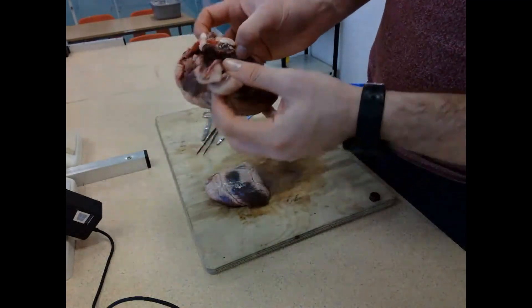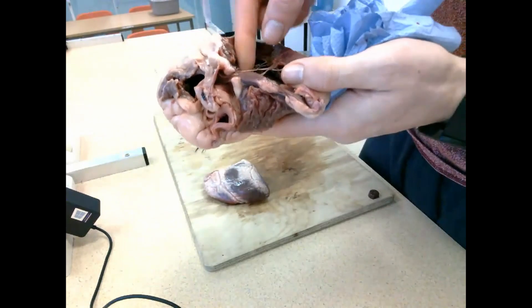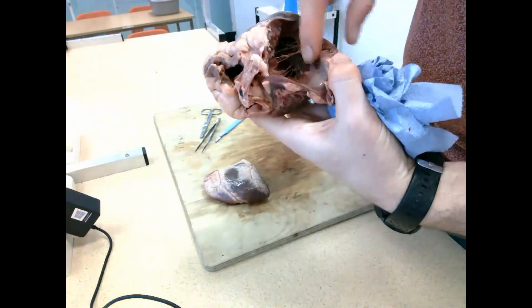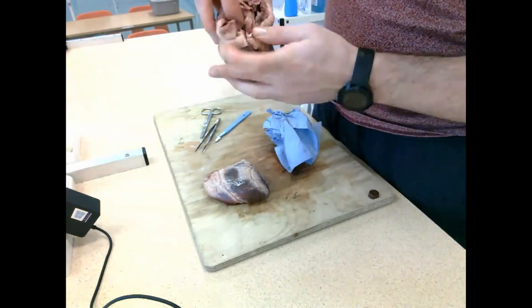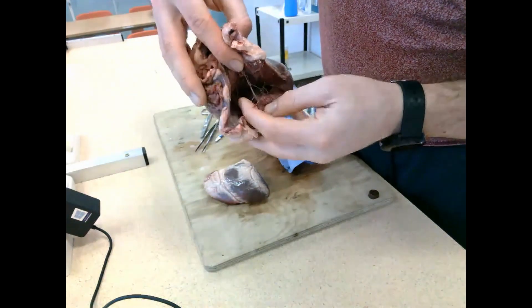You can see the left ventricular wall is absolutely massive and really thick, really muscular. You can also see the chordae tendinae there, which pull on the valves to open and close them depending on what stage of the heartbeat we're at. The valve you're seeing on the left hand side is the bicuspid valve.